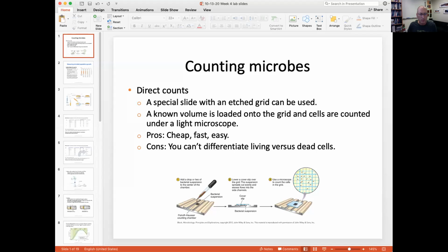This video is for the lab for week 4. We're going to talk about how you count and analyze microbial populations. Okay, so I'm going to share with you this PowerPoint for the lab. Now this is all material from section 6.4 in your textbook.